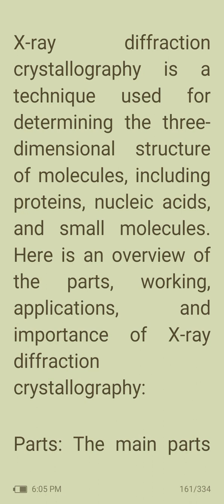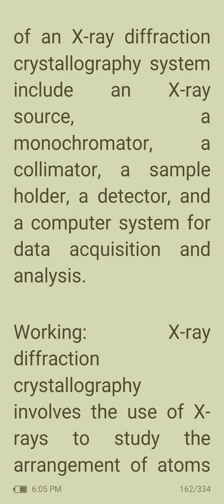Which are the parts? The main parts of an X-ray diffraction crystallography system include an X-ray source, a monochromator, a collimator, a sample holder, a detector, and a computer system for data acquisition and analysis. So let's learn about the working.